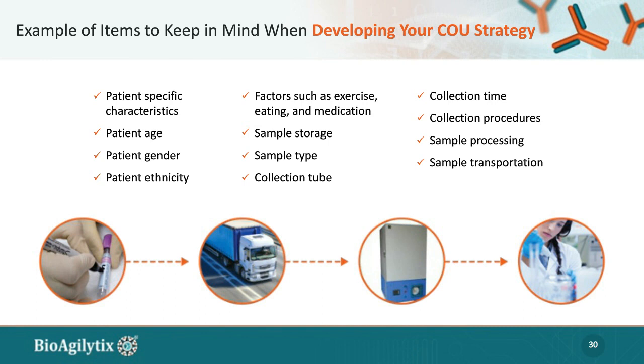You have this list. Now, I know I have a lot of people that have called into this webinar from a contract research organization, and sometimes we're not privy to all the conversation and discussion that are going on. You might get a client coming to you and say, here's this assay, just buy this kit and validate it. But this is something that we highly recommend to our own internal scientists, and we try to make sure the client understands that this is really a partnership when it comes to developing these biomarker validation and sample analysis.